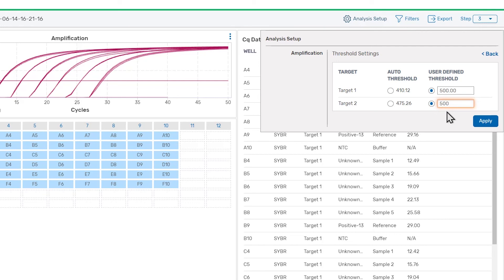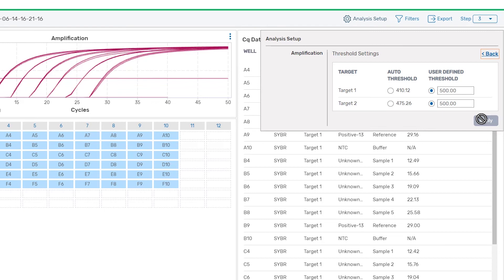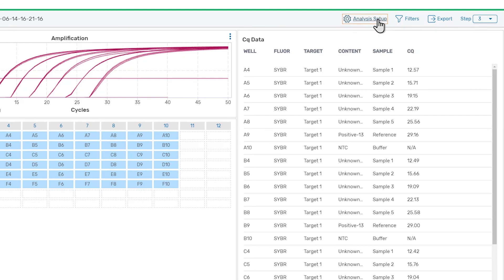Once these values are set, click Apply to update the amplification data with the new thresholds applied. Click on the Analysis Setup Toolbar button or anywhere outside of the panel to close it.